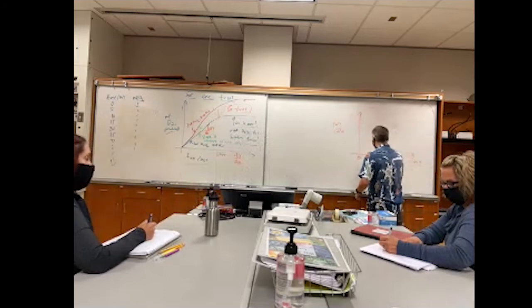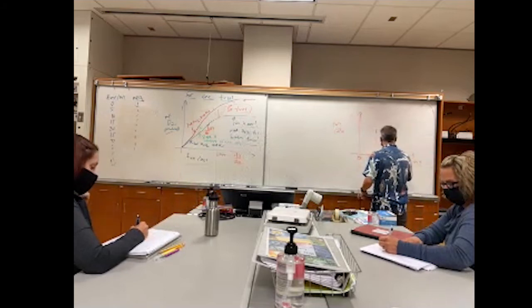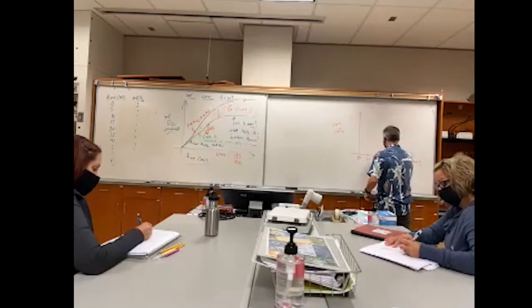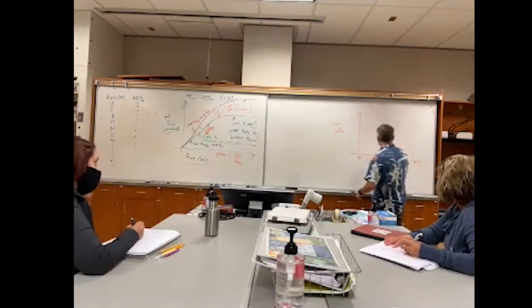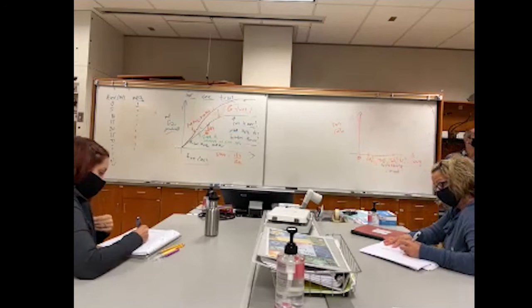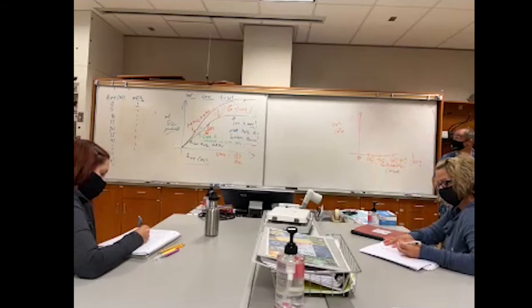Then we have like 20%, 50%, 60%, 80%. Those are just the different ones, trial 1, 2, through trial 6. You'll be mixing up each of these concentrations as you start each trial. It's a little bit simple, so go through it.